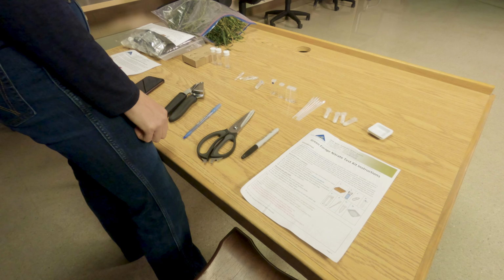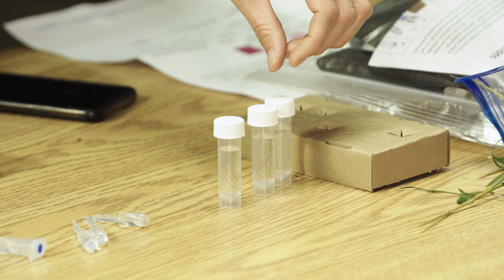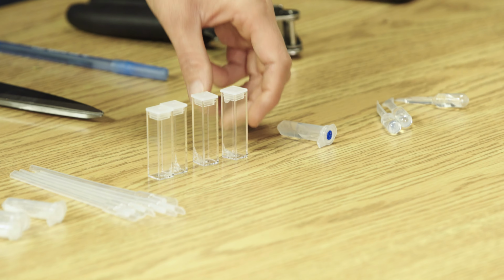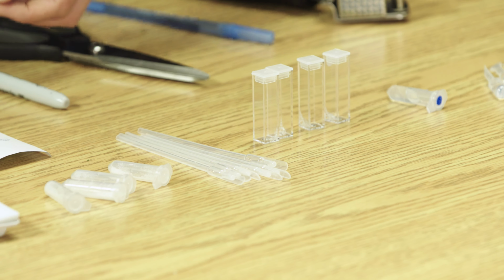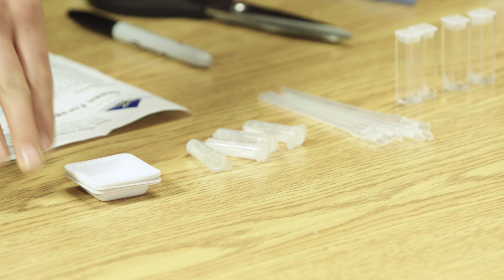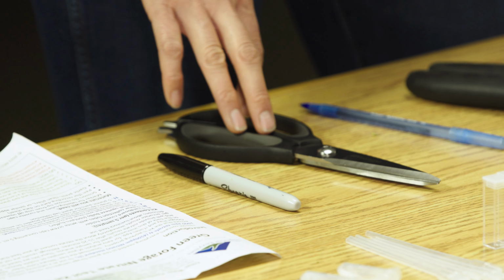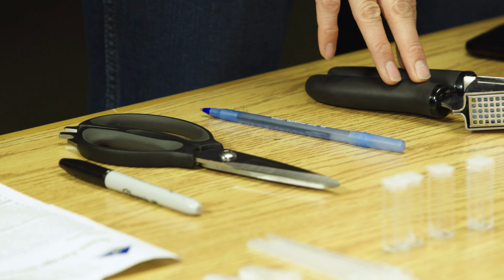Included in your kit is a cardboard holder for holding the square cuvettes, clear collection tubes with 5 milliliters of water, squeeze bulb containing buffer, one snap cap tube with a blue dot containing the nitrate standard, square reaction cuvettes with one containing a blue dot for your standard, pipettes, snap caps containing the reagent powder, and plastic pans for sap collection. Additional materials you will need are a marker for labeling the tubes if you are taking samples from multiple fields, scissors for removing the snip-off bulb squeeze tube, a pen for data collection, and a garlic press for squeezing the sap from samples.